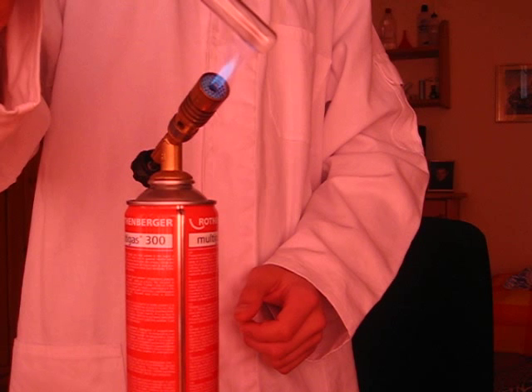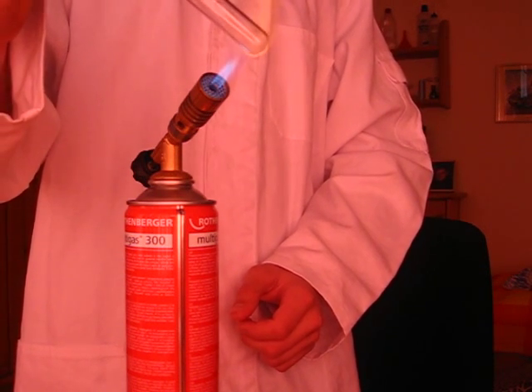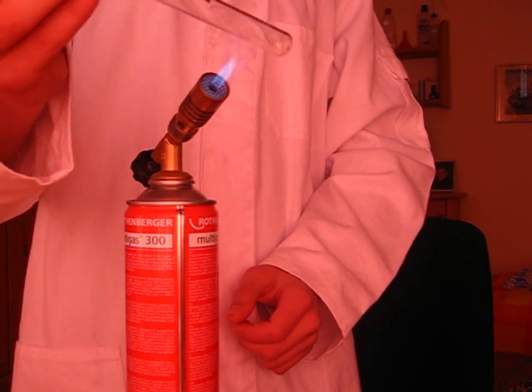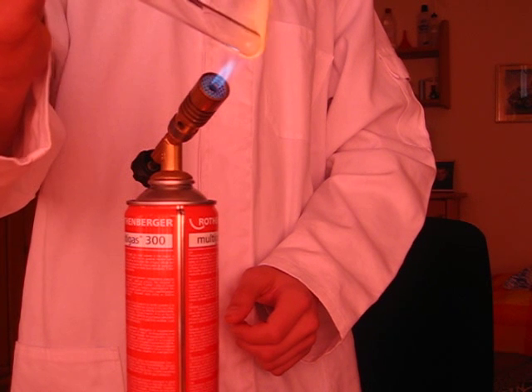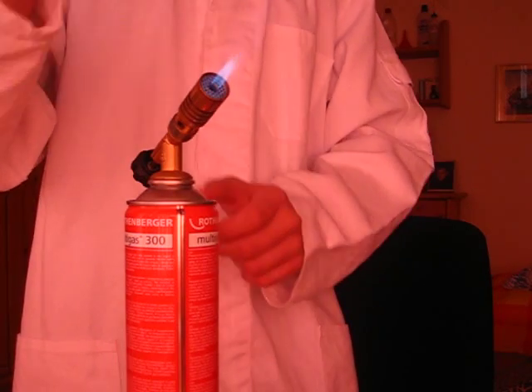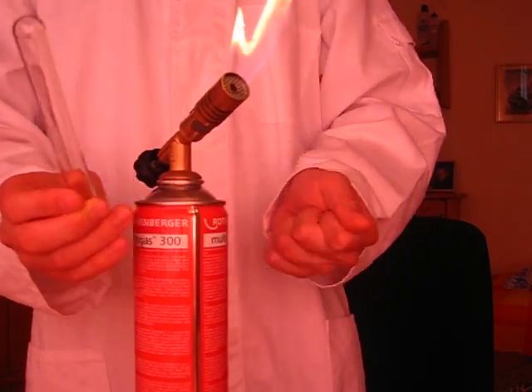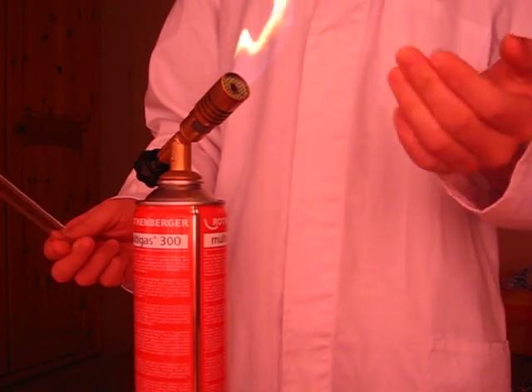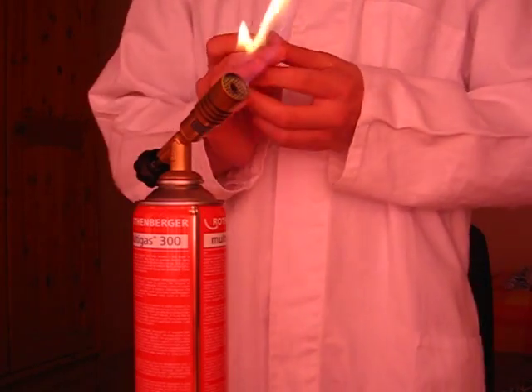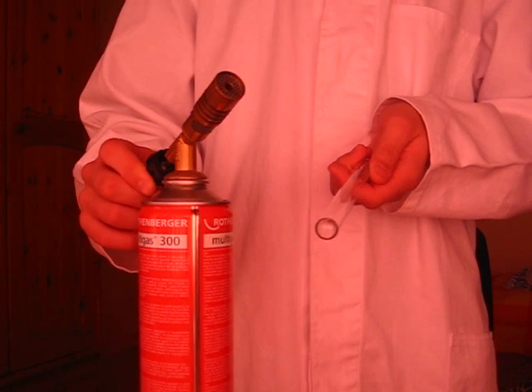As you notice, the test tube is almost clean. So if you use the Bunsen, you have to turn it to this invisible flame. Keep your long hair back, and if you notice, if you don't use the Bunsen, switch the gas off.